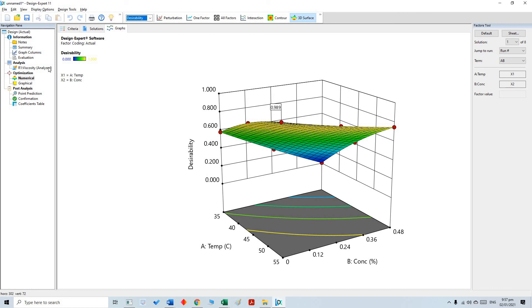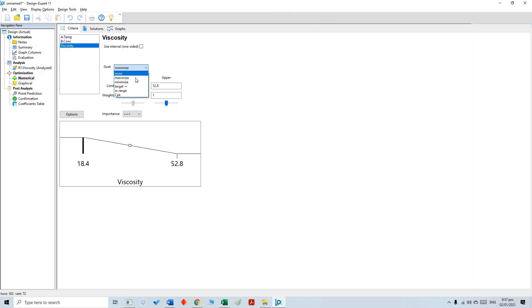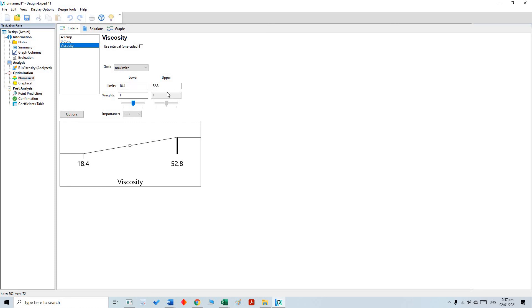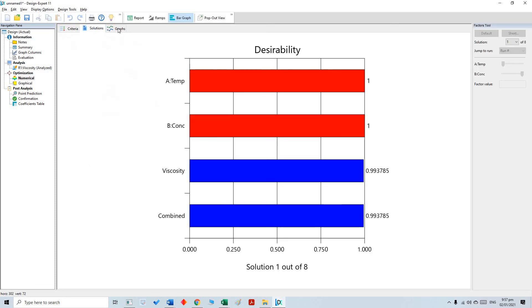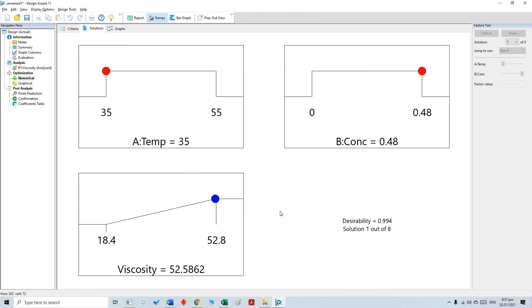Similarly, we can change the criteria from minimize to maximize and get the solution again, either graphically or as a ramp. Our maximum viscosity is 52.5, and at that maximum viscosity the concentration must be maximum while the temperature is at the lower end. That was a short introduction to Design Expert version 11 — how to generate a model and how to do the optimization. Thank you so much.